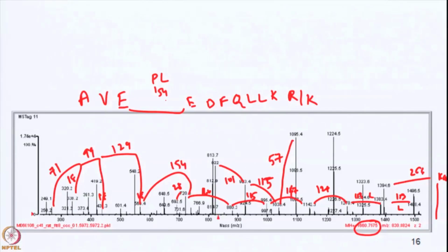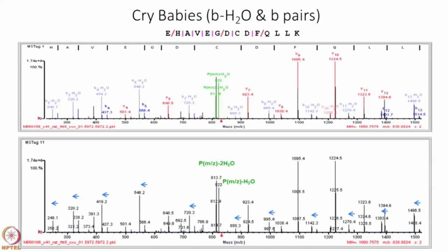GD. 566. Oh, 720. Oh, it wants to go down to that one. All right, well, pretty close. Okay. All right, that's the end of that.